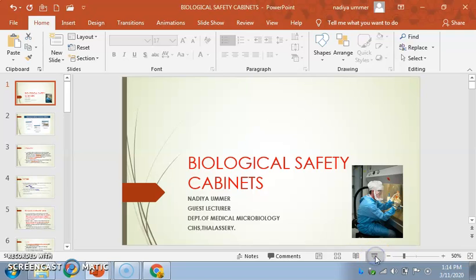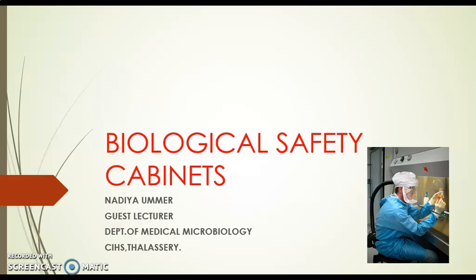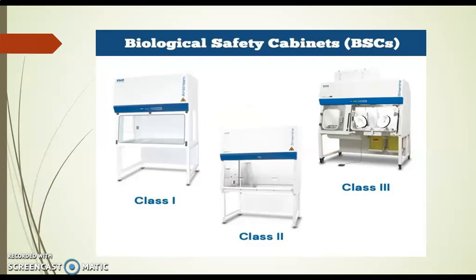Good afternoon, all. So, our next topic from the methodology and instrumentation is about biological safety cabinets. This is the picture of the three types of biological safety cabinets which are used in our laboratory.